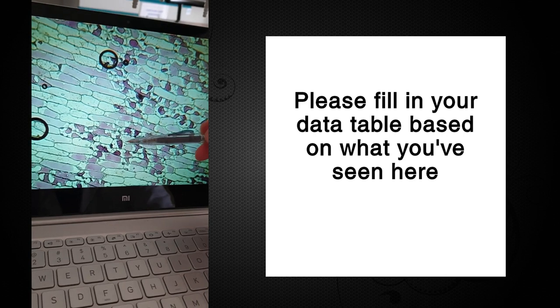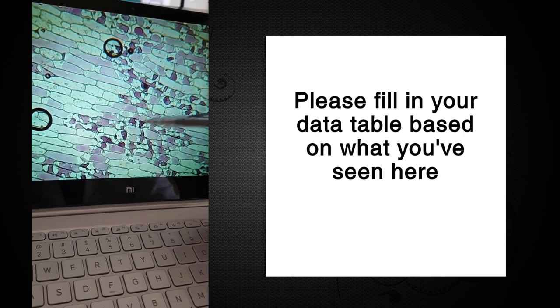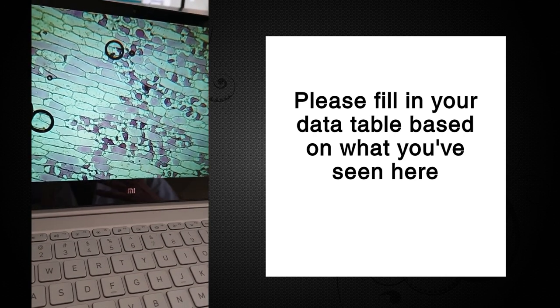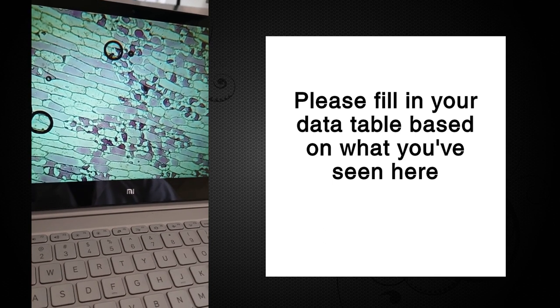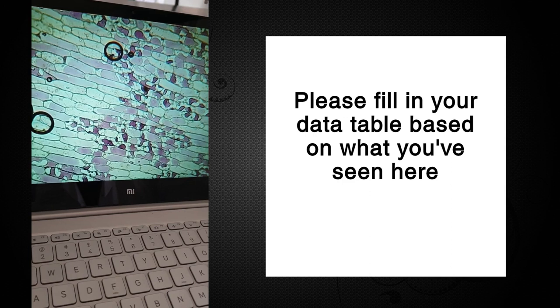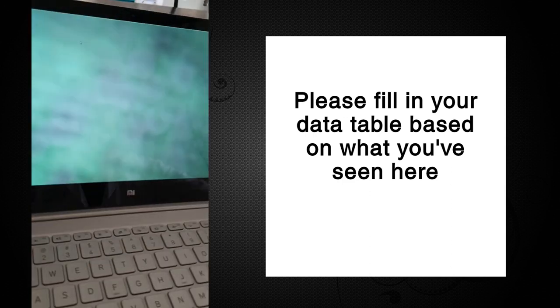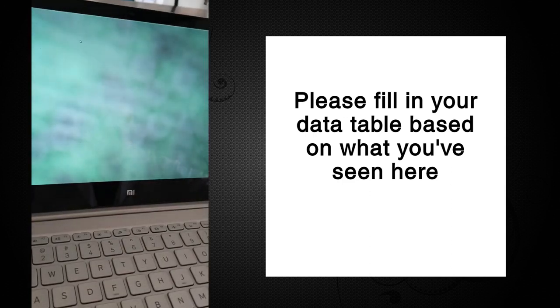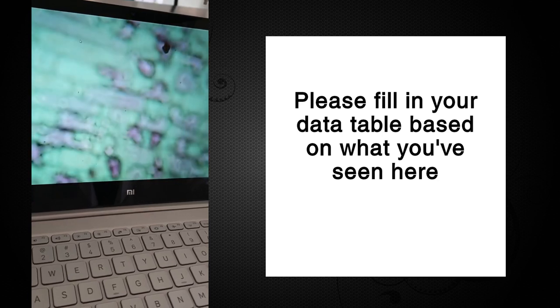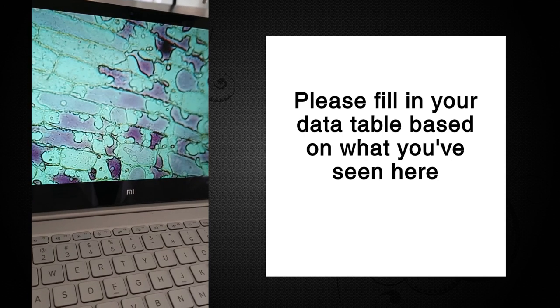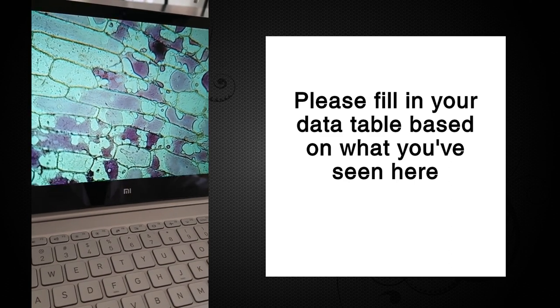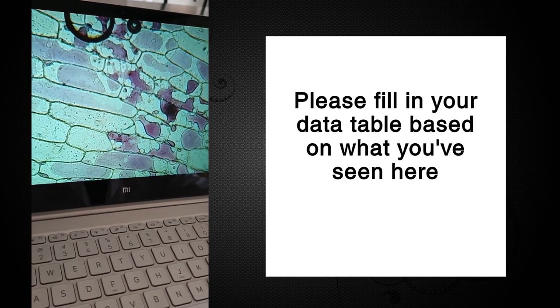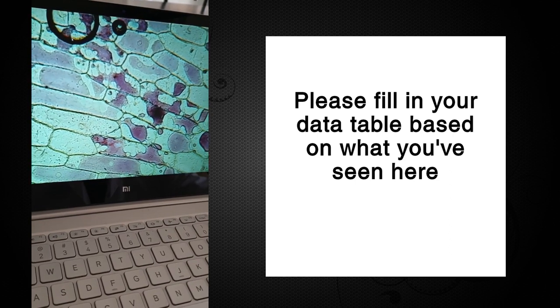And in here, for example, you have a very intensely stained pink region. That's just a cell that's completely shriveled up. It's very shrunken. And so it looks darker because the concentration of the pink material, the pink dye, is much higher because the volume has decreased inside the cell. So let's go to higher magnification on this one again, just so we can compare apples to apples.